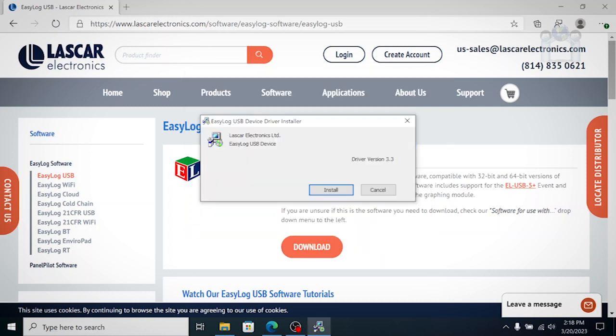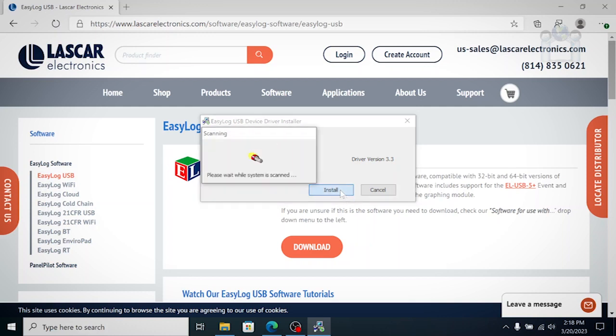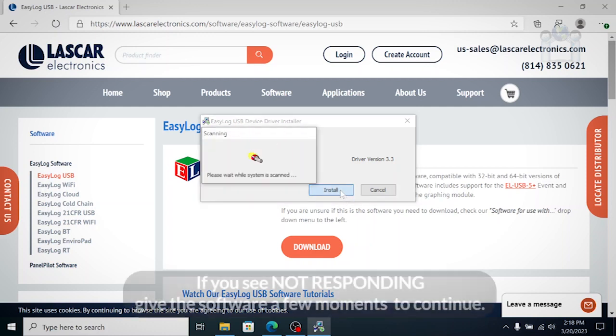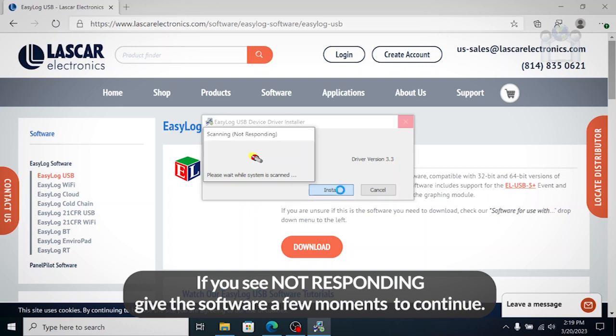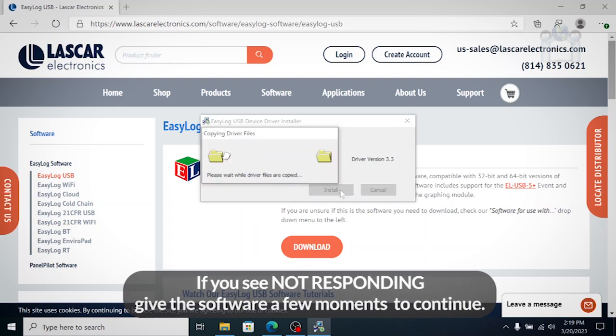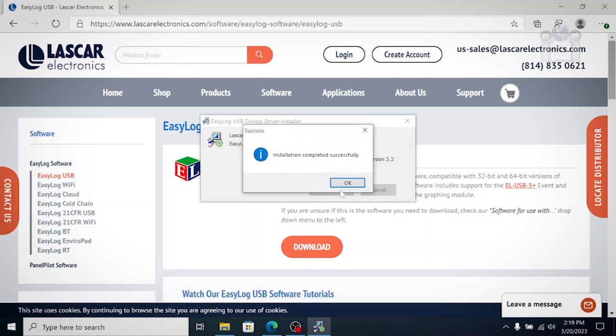A second part of the install will immediately launch, the USB device driver installation. The software will scan your system for a few moments, install the driver files, then tell you the installation was successful.